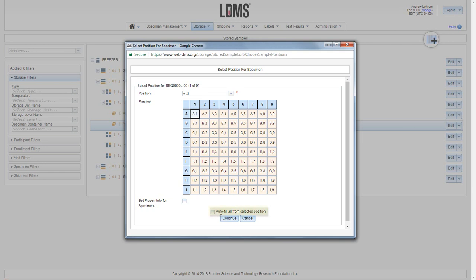You can also choose to auto fill. This will assign all of the specimens positions 1 through 9 according to the fill order. In this case it is left to right, top to bottom. So it will start at A1 and end at A9.